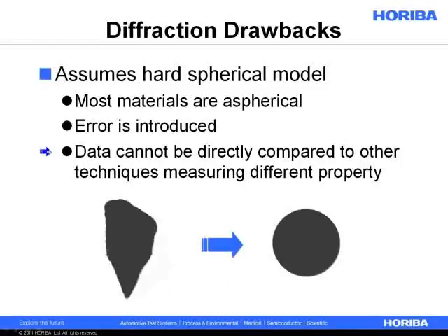Really what they're doing is different things to the imaginary component of the refractive index, which every vendor should be able to do, because again, that's how you correct for things like shape. It's how you correct for things like absorbance and reflection.